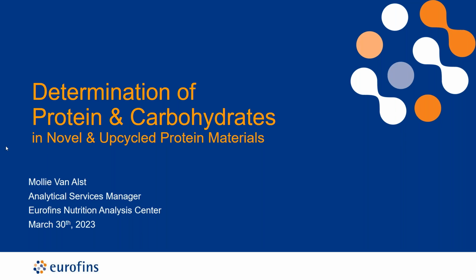Truly my main function and focus is to hone in on nutrition labeling regulations and keeping those in perspective when it comes to services that we offer here in the lab, as well as what gaps are within the current industry and the technical challenges that arise with respect to the labeling regulations. So today we're going to talk about an alternative method of determining protein and carbohydrates in novel and upcycled protein materials, which you know because you've signed up for this webinar.